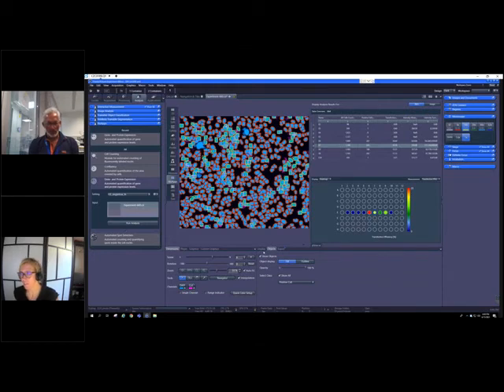Yeah, that's great. I think Colleen alluded to the fact that she would have loved to have something like this when she was still in the lab, just for documentation purposes and knowing what tissue you imaged before on a slide that has 12 sections on it. So this is great. There's a question here. I believe they're basically referring to the AI Sample Finder, the new equipment. They asked if you could elaborate on the optics and lighting schematics. I assume they're referring to the 32 or the 128 LED array. So maybe, Gert, since you also went over that in your presentation, can you elaborate a little more on that?